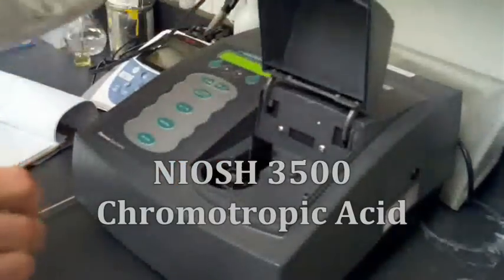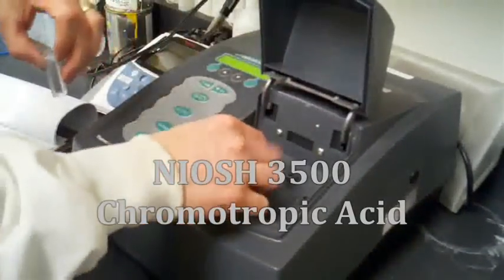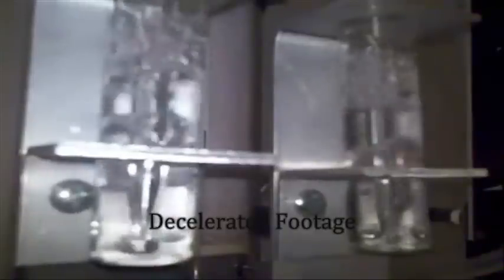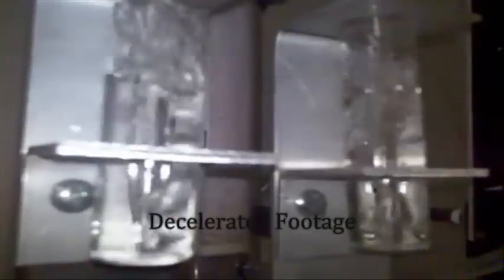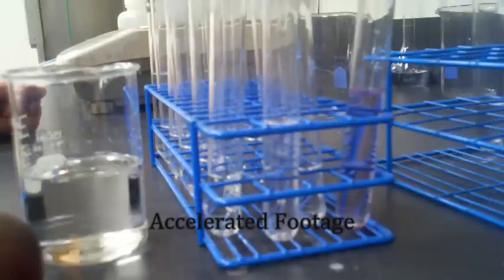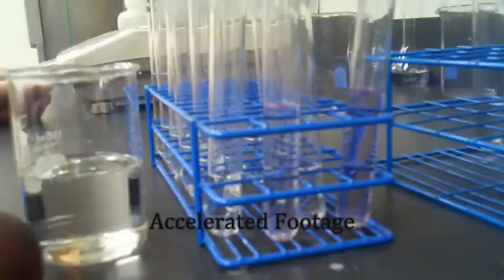The analytical method specified by this test method is a slightly modified version of the NIOSH 3500 method where air is bubbled through an impinger containing a 1% sodium bisulfite solution. This solution is then mixed with chromatropic acid and sulfuric acid to cause a color change proportional to the quantity of formaldehyde in the solution.